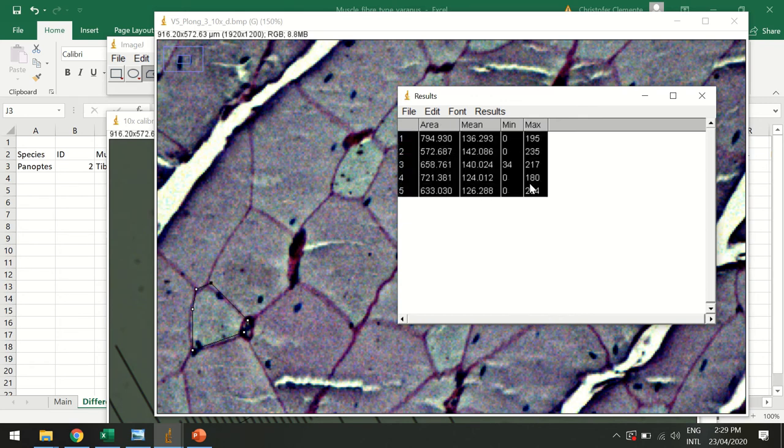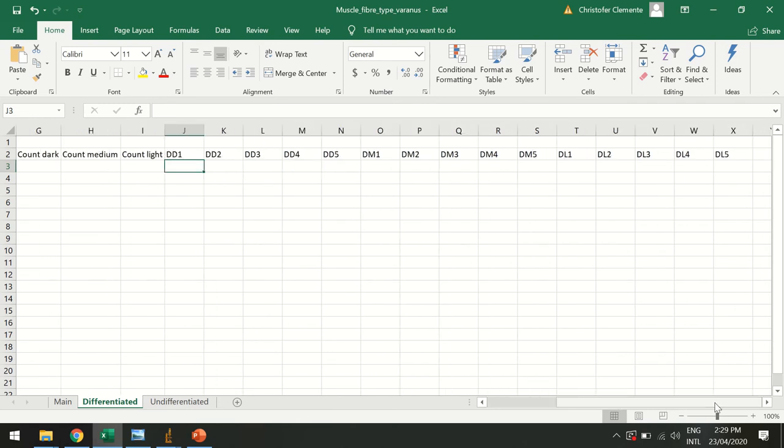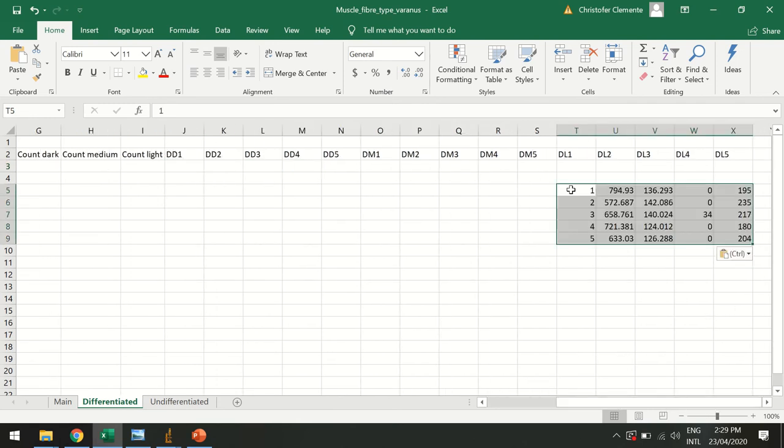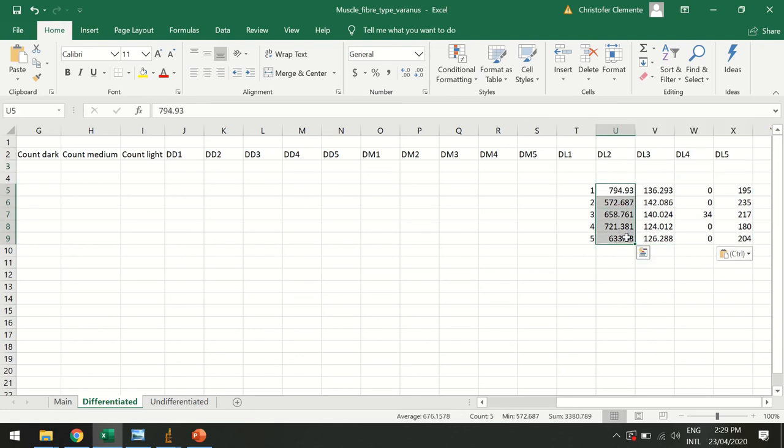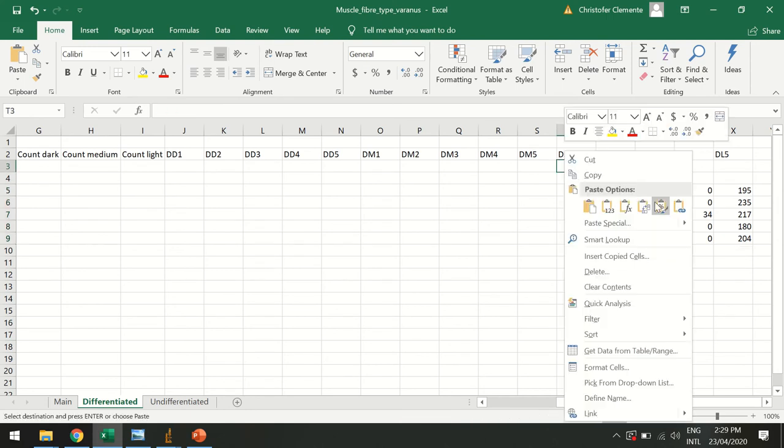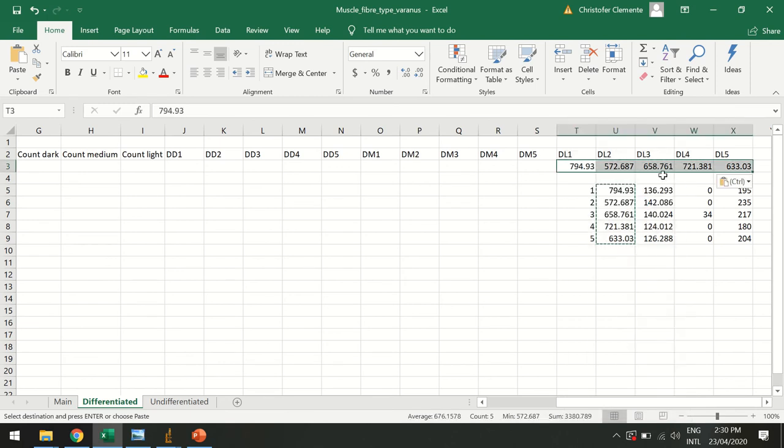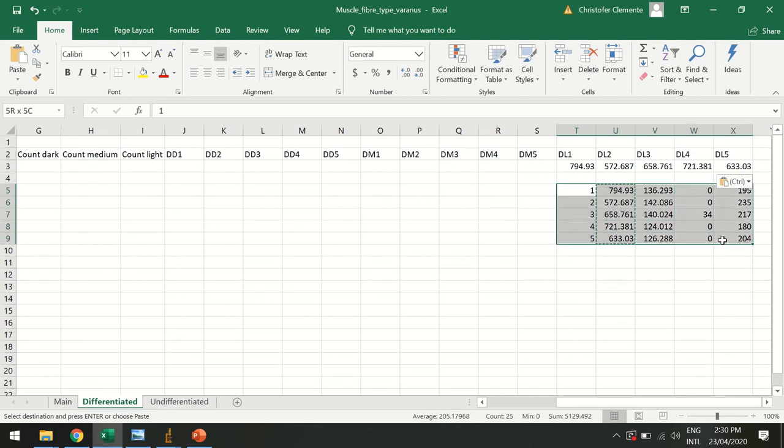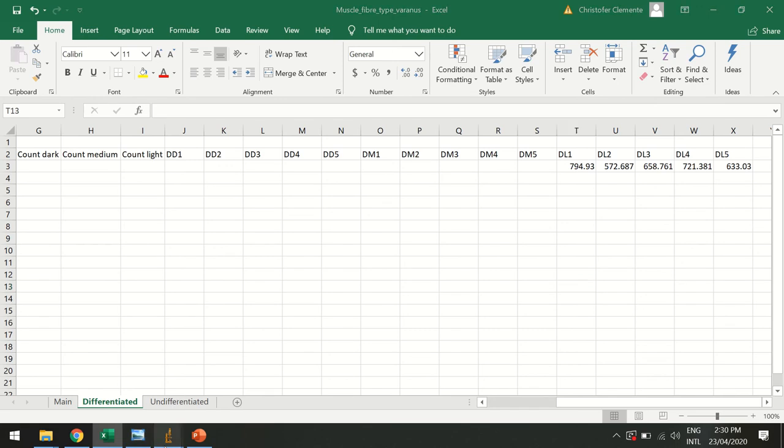Okay, so now if I go back to my results, I should have five areas there. So that's looking real good. I'm going to highlight them all, control C, copy, bring them into here. Now what I find the easiest thing to do here is just paste them. I actually want them in a row here, so this was the area. I'm going to copy just this area here, right click where I want them to be, and I'm going to paste transpose. That's going to put them along in a line like that. So now I can just delete all this and that's my life.